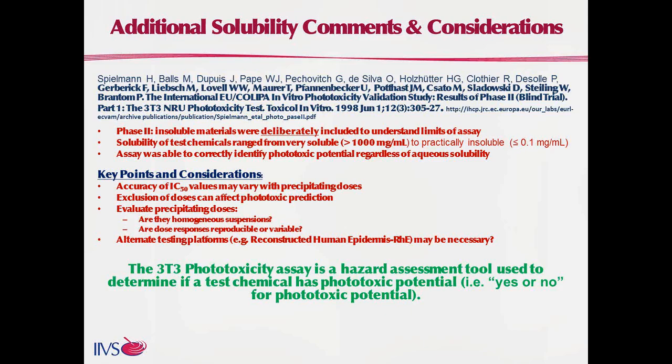And while we may not achieve precise IC50 values in dealing with test materials that are not completely soluble, both the case study and phase 2 results demonstrate that this assay is able to identify test materials which respond differently in the presence as compared to the absence of light. We should keep in mind that the 3T3 phototoxicity assay is designed as a hazard assessment tool that can tell us if a test material has phototoxic potential or not.